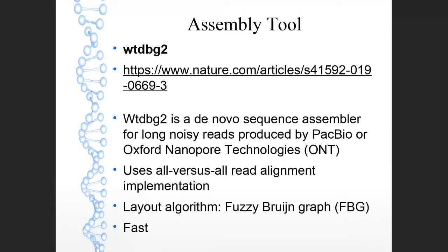You can always set them running and come back to them the next day, or after you've done some work, or after lunch. Or you could use the downtime to do some reading, maybe read up on how the assembly tool works, or do some other work. So you can set this up and hopefully get it running in the background.